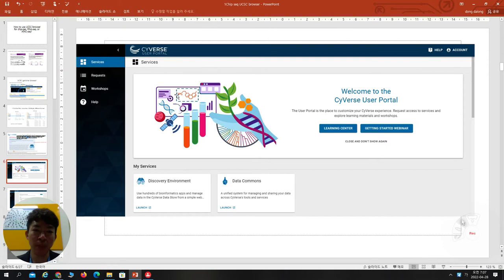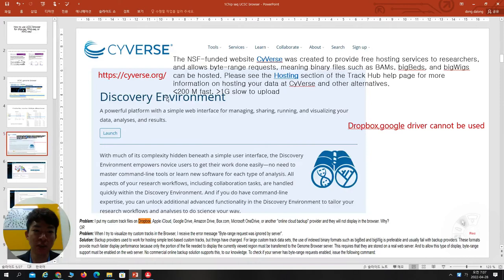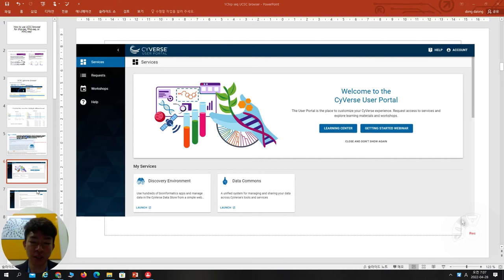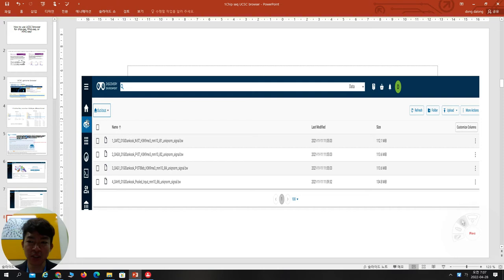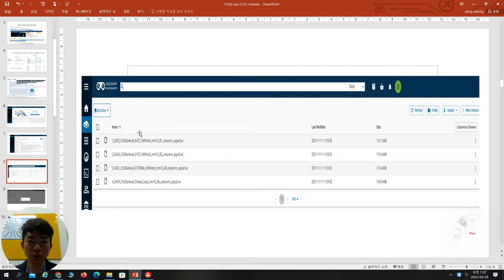When you visit the Cybers site, you can find this page. You need to go to the 'Discover Environment' page, click 'Analyze,' then 'Launch.' After logging in, you can find your data. You can upload your file here — I've also uploaded mine. For uploading, you have to create your own account.